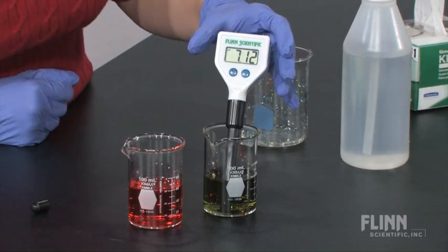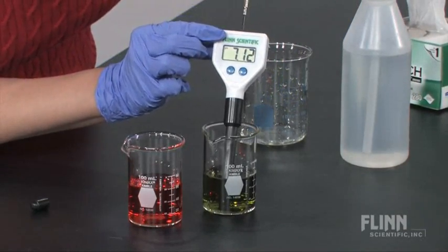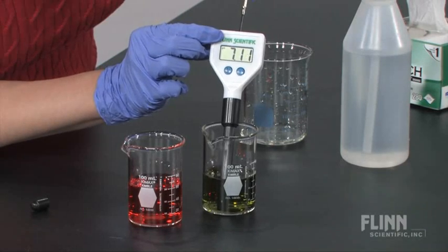We also perform calibration and quality control tests on the pH meters to ensure their accuracy greater than plus or minus 0.2 pH units.